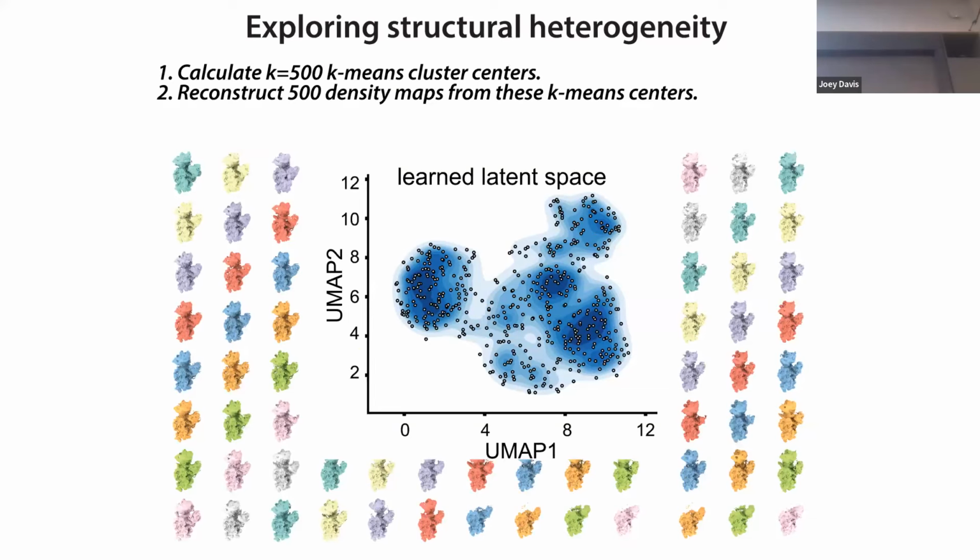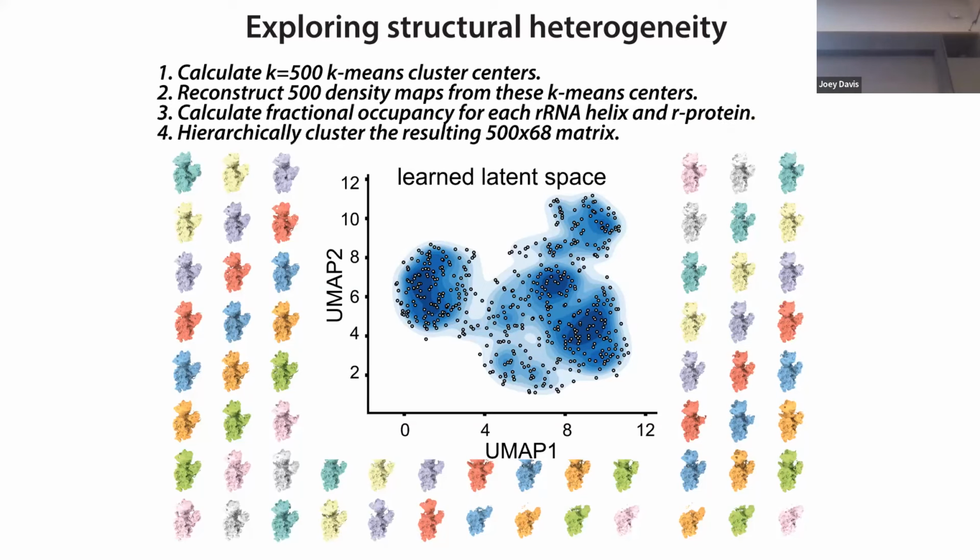And then what, right? It's a pain to build models for one structure, particularly something as large as the ribosome. And I'm very good at motivating my students, but I cannot convince anyone to build models for all of these and interpret them. So we try to take a simpler approach to looking at these ensembles. The basic idea was, well, we have the atomic model for the 30S. So we can just dock that in, and then at every position that we're interested in, be it a ribosomal protein or an rRNA helix, we can just ask how much of the density that we know should be there when it's natively folded do we actually observe.